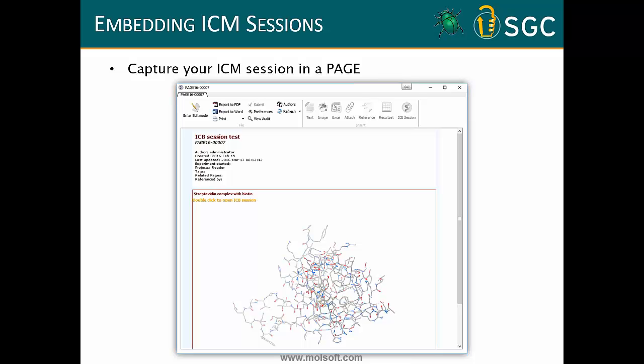Right. So for the plots, what you saw were images, and what we've imported are images. They're not actual links back to the raw data, not in this context.